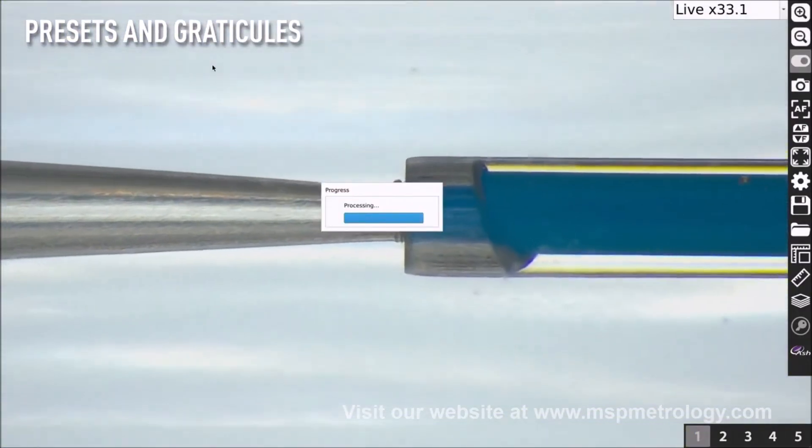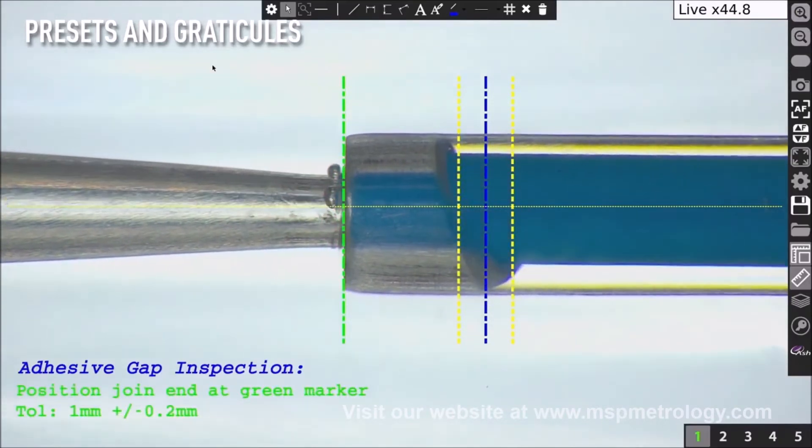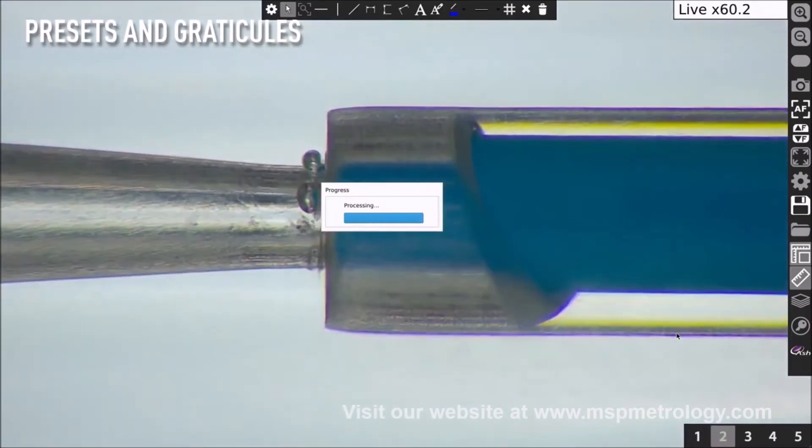On-screen preset buttons allow quick access to pre-configured, part-specific system settings. On-screen overlays enable the go, no-go, rapid inspection of samples.